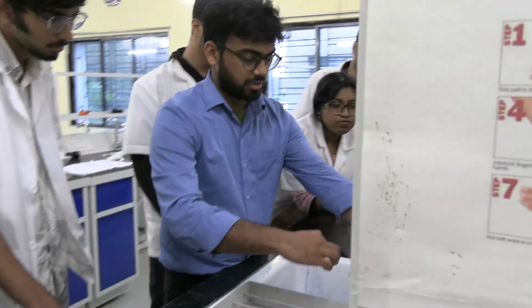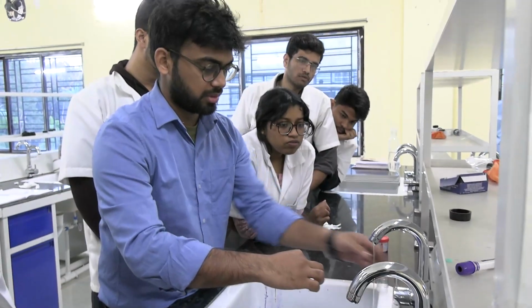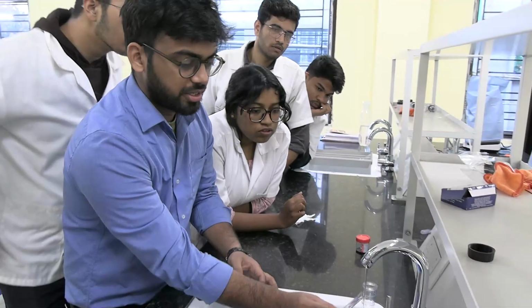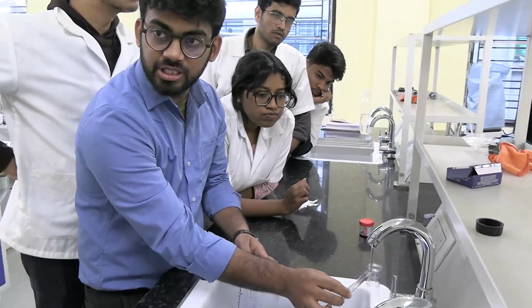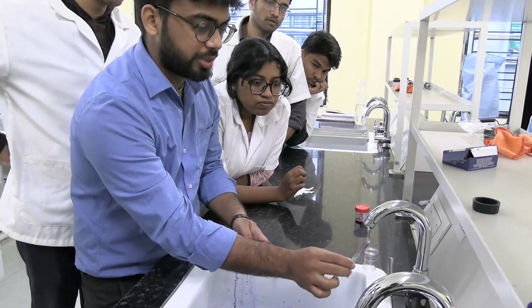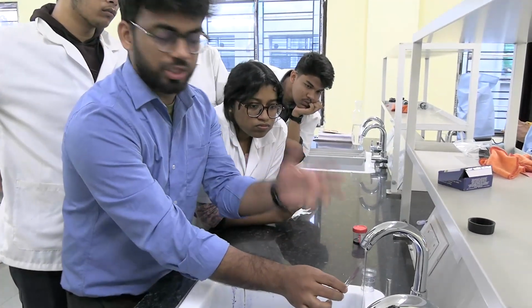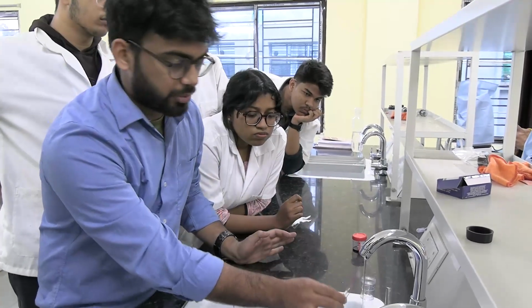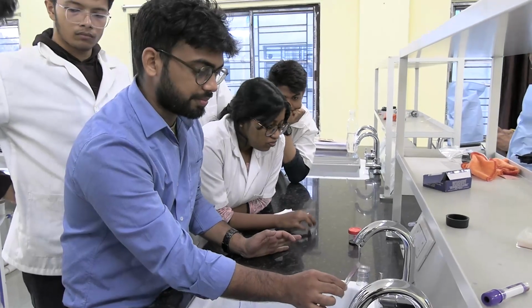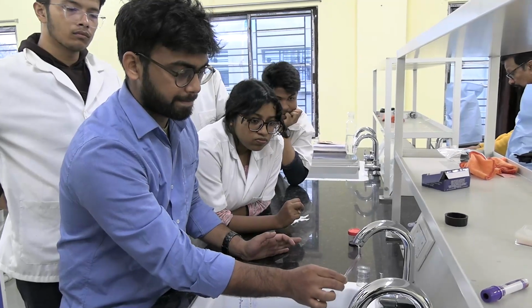What else will we do with this? The water flow. Same line, and then, okay, I can see pinkish green. It is not bluish in nature. It has become a perfect line now. Suppose we do this for 2 minutes. Not 2 minutes, 1 minute is enough. We clean it like this. There is much of this bluish tinge. It needs more time. No, it doesn't need more time. It already has a pinkish tinge now. The flow should not be too much.